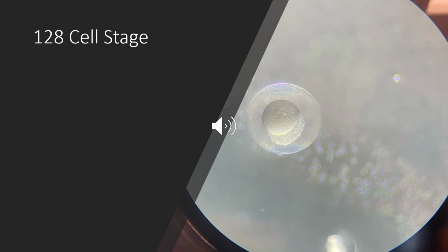Moving further into development of the zebrafish, the 128-cell stage was observed. This stage is typically observed a little past the 2-hour mark of development. The aggregation of cells is clearly visible at the animal pole, showing how meroblastic cleavage occurs.